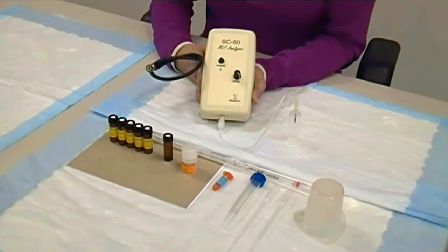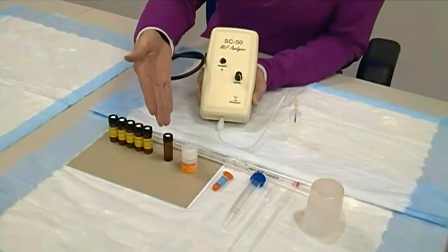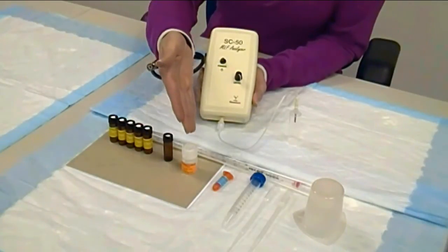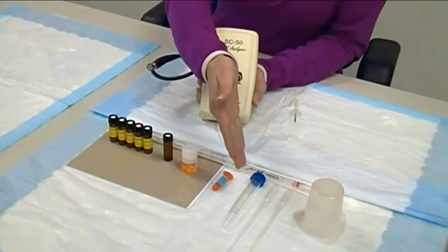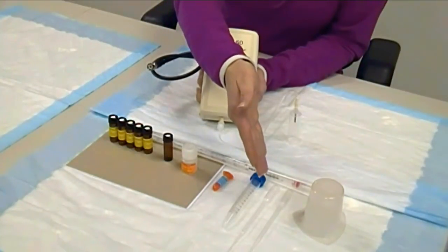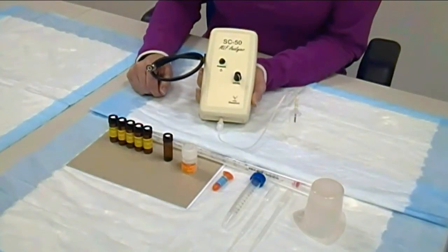The SC50 is an add-on to Vinmetrica's SC300, 100, and 100A. The kit comes with everything including the SC50, 5 reaction vials, 1 blank vial, boost juice, 1 molar malic acid, a 15 ml conical tube, 2 transfer pipettes, a 100 ml plastic beaker, and a 10 ml pipette.